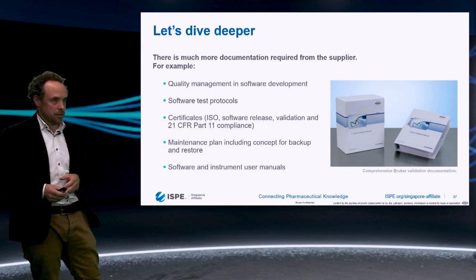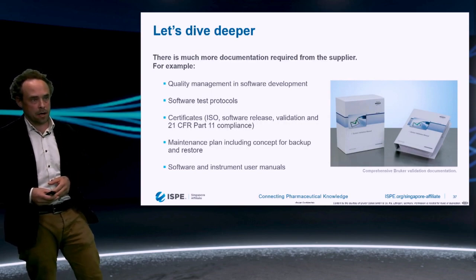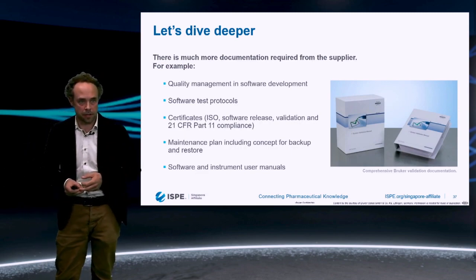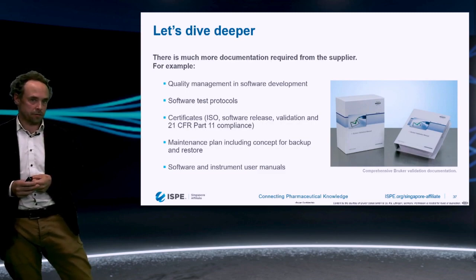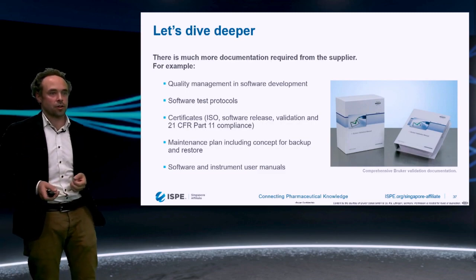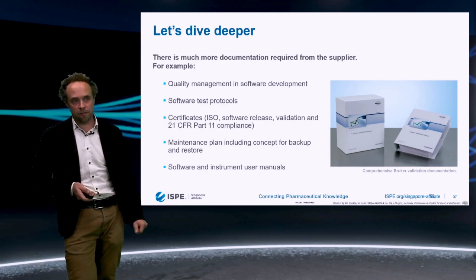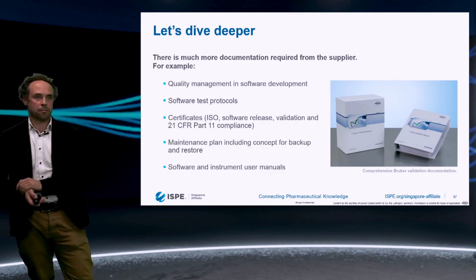Of course, we need to have as well a maintenance plan and concept prepared, including topics like backup and restore of data. And of course, all needs to be supported with software and hardware manuals, and such documentation sums up basically to a lot of paperwork at the end, where it's needed that a vendor can support properly.